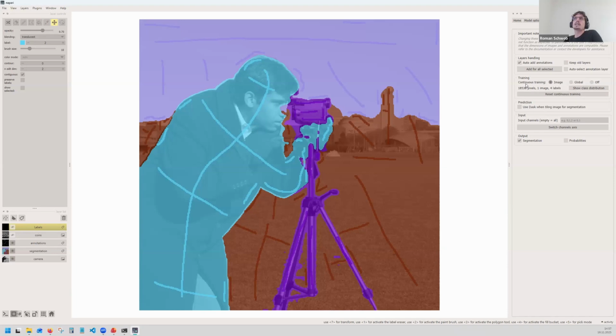And there is actually also a way that we've already implemented that lets you train on multiple images. I wanted to talk about this later, but it fits pretty well here, so I'm going to explain it now. It's the setting called continuous training. We're saving the features that we've extracted, and you can keep them saved within the model.